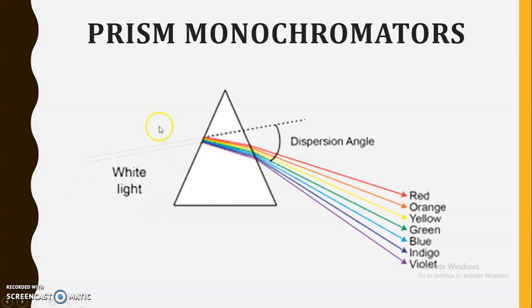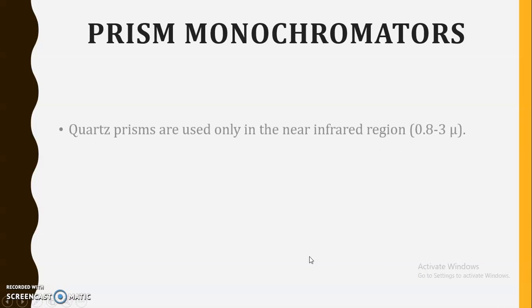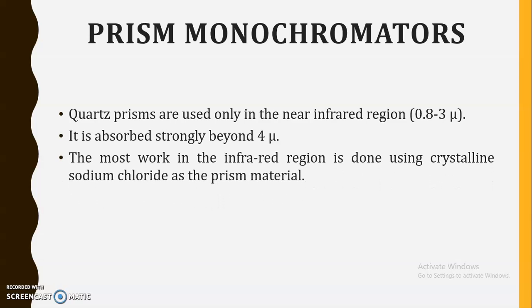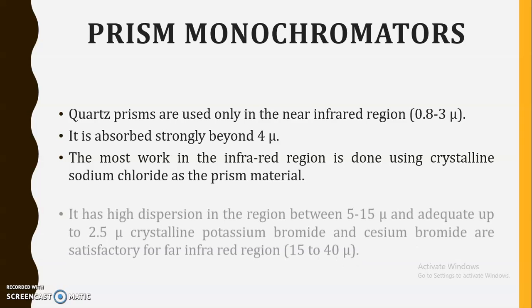So white light, that is the polychromatic light, when it falls on this particular prism, will be separated into its individual components, and the light is dispersed into its individual wavelengths depending upon the frequency of that particular light. Quartz prisms are only used in the near infrared region, that is the range 0.8 to 3 micrometer. It is absorbed strongly beyond 4 microns. Most work in the infrared region is done using crystalline sodium chloride as a prism material.